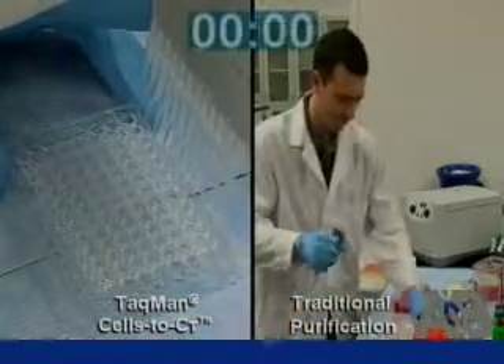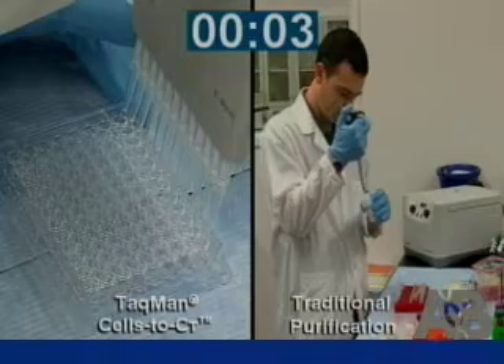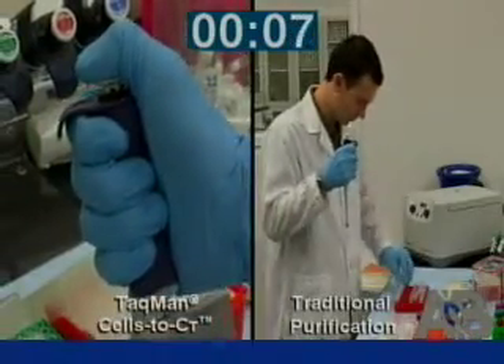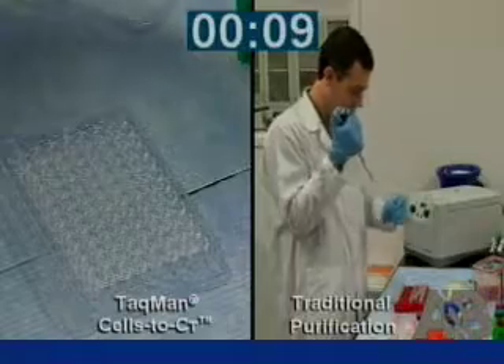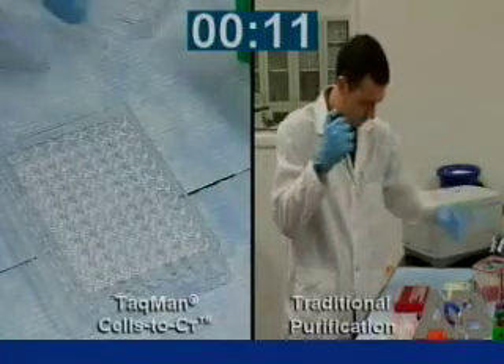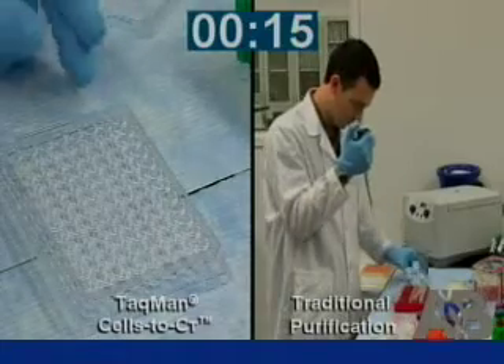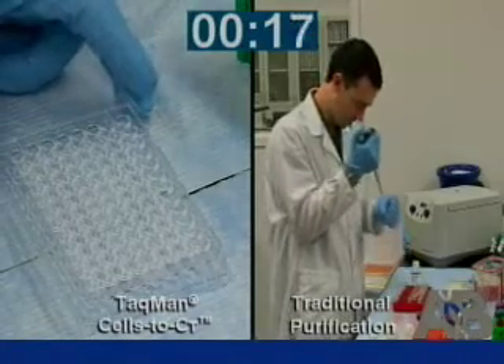The first thing we'll do is add lysis solution to the cells in the plate. We then mix up and down five times with the pipettor and incubate at room temperature for five minutes. Every 30 seconds we'll start another row, and before the five minutes is up we'll have added lysis solution to the entire plate.